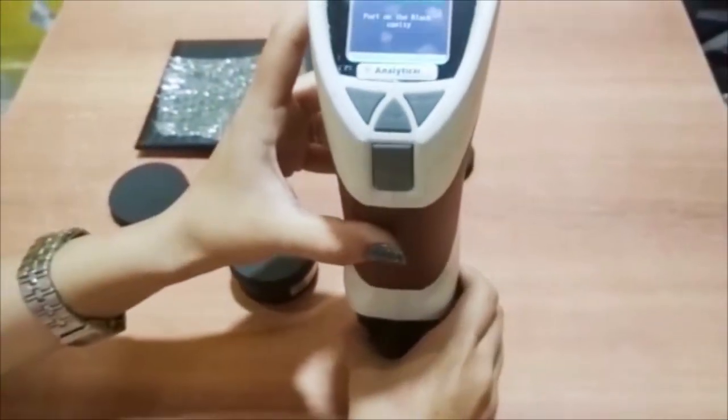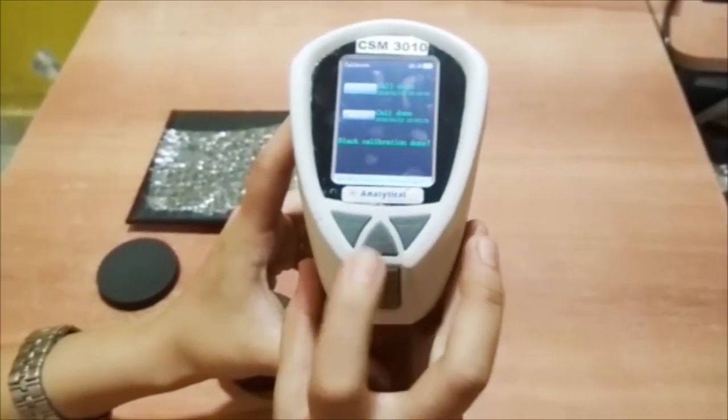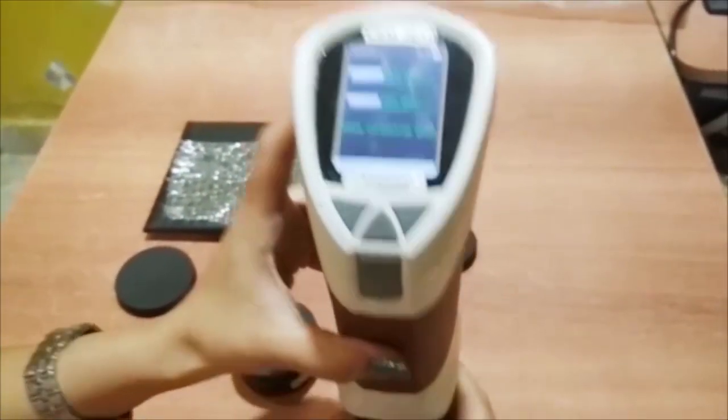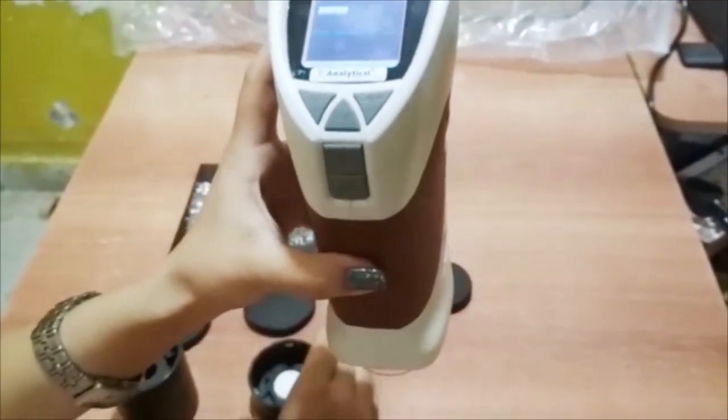Through the up and down buttons, choose black calibration and press the enter key. It will show black calibration done. Repeat the same for white calibration.